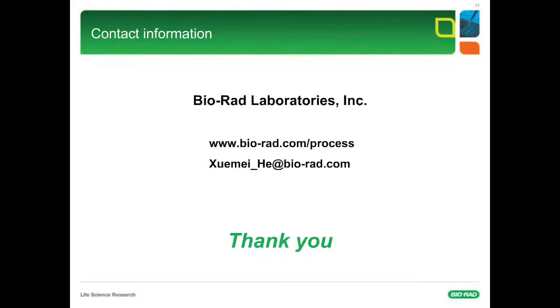And the additive I usually recommend is arginine because it has been used widely in industry and in approved purification processes. So a lot of the time it works. And also, when you handle arginine, it's not as messy as, for example, urea or guanidine hydrochloride.